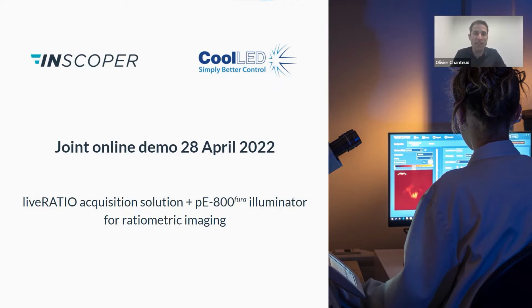So last year at INSCOPER, we were preparing this new commercial solution for ratiometric imaging when coolLED launched a new illumination source on the market. And this new pE-800 fura is perfectly suited for the probes used for calcium imaging. This is why we decided to test these two new products together and present the results to you today.